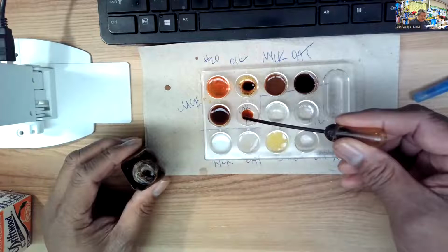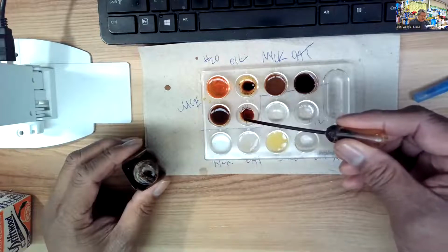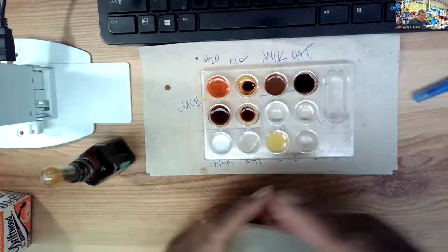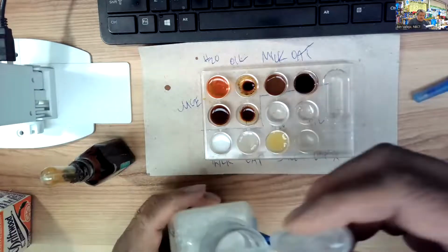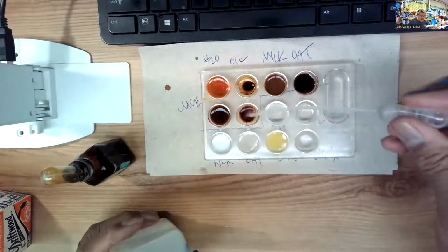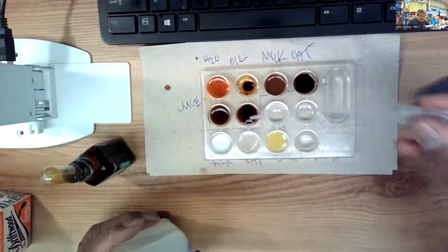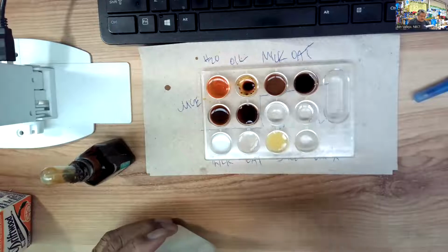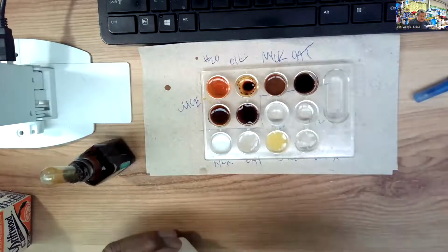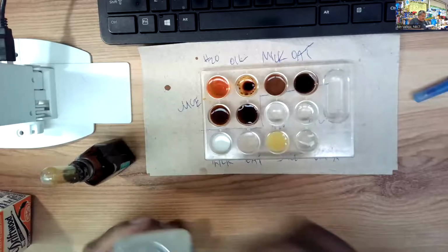And then the unknown. You know, I didn't add the unknown, did I? So let's go back. I'm going to add the unknown to it. Let's see whether it changes color or not. There's the unknown there. And there's the unknown there. Okay.